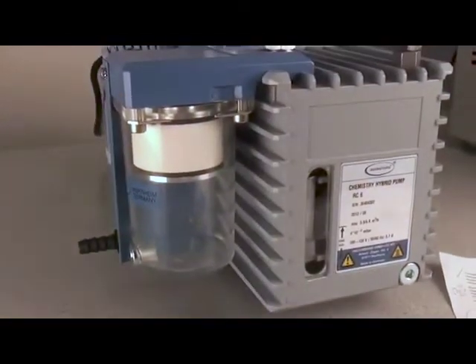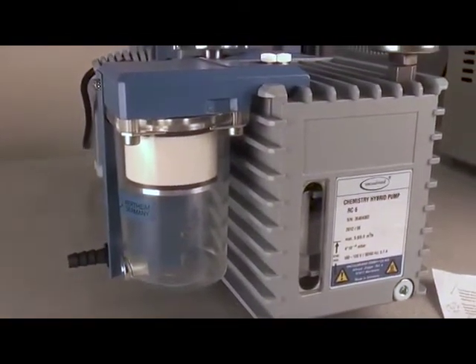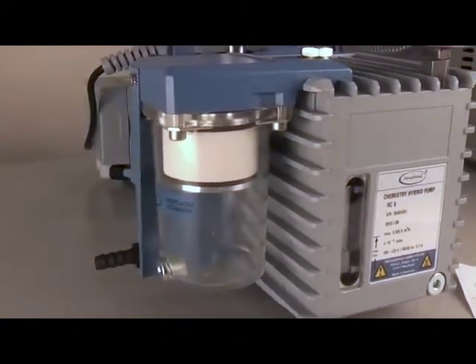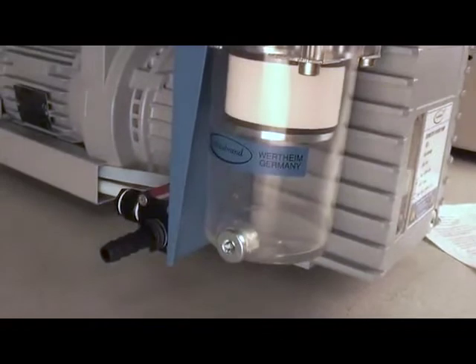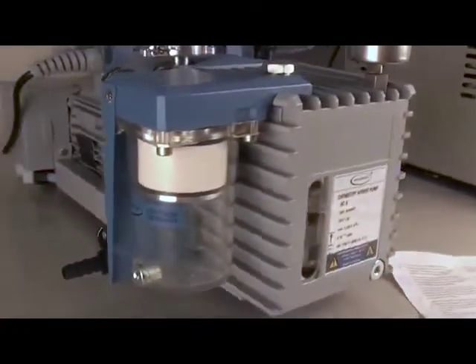Before each use, check the oil level and clarity using the viewing window on the front of the pump. Monitor the levels of the catch pot. The condensate levels must be below the bottom of the separator tube.